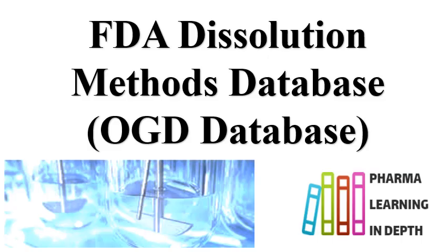And the FDA Dissolution Method Database, also called the OGD database, provides the methods used for dissolution testing.